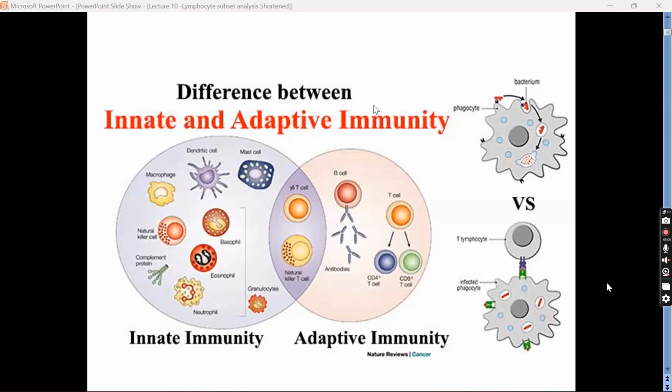It's fine to have auto gates and directly get it from the template, but still I would suggest everyone supervise whether the gates are correctly drawn, the regions are correctly drawn, and the populations are all fine. There should be no debris or any other artifacts involved in false counts. All these things have to be checked. That is the reason why I want to explain why this test, lymphocyte subset analysis, is being done. Just saying lymphocyte subset analysis doesn't make any use.